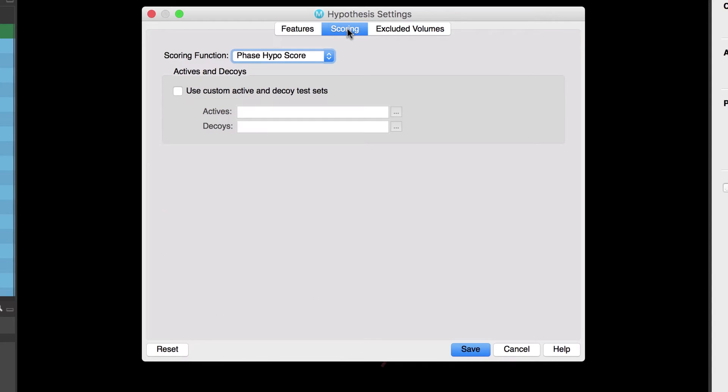Over in the scoring tab the default scoring function for ranking hypotheses in common pharmacophore perception is phase hyposcore.